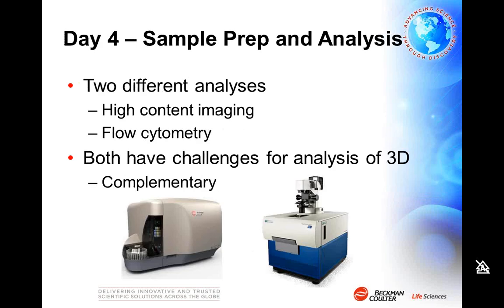So after 24 hours of incubation, we then had to do 2 different forms of sample prep and analysis because, again, we wanted to show how high-content imaging and flow cytometry are both excellent ways of analyzing cell cultures, but both have challenges when it comes to analyzing 3D cultures. And it turns out the 2 are very complementary, and hopefully I'll be able to describe that.